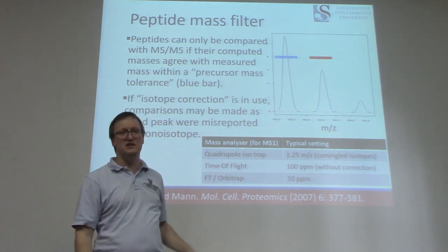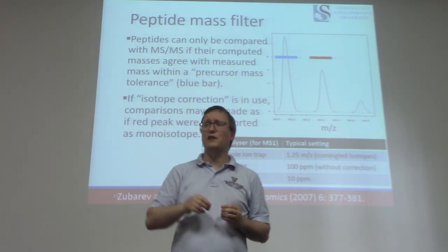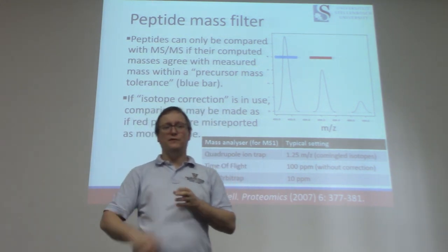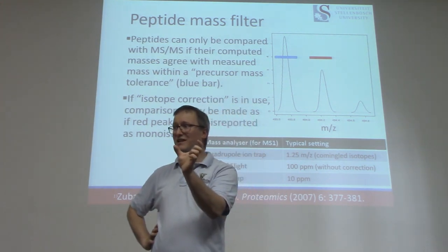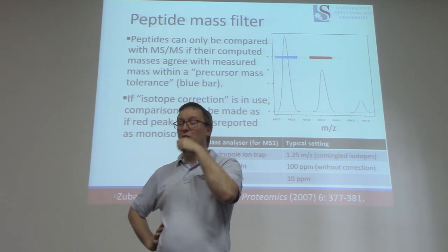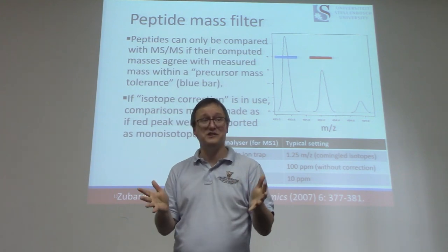You can see that their mass accuracy is measured in PPM. Does everyone know what PPM is? Scan rate is not a bad guess here, but what? Parts per million, exactly, right. So if you're predicting the mass of a 1,000 m/z ion, you can ask what would 10 parts per million be? That's 0.01 m/z. It's a tiny little error. So you can easily discern at that level which isotopes are present for a thing. Telling one neutron's difference apart is trivial on instruments like this.